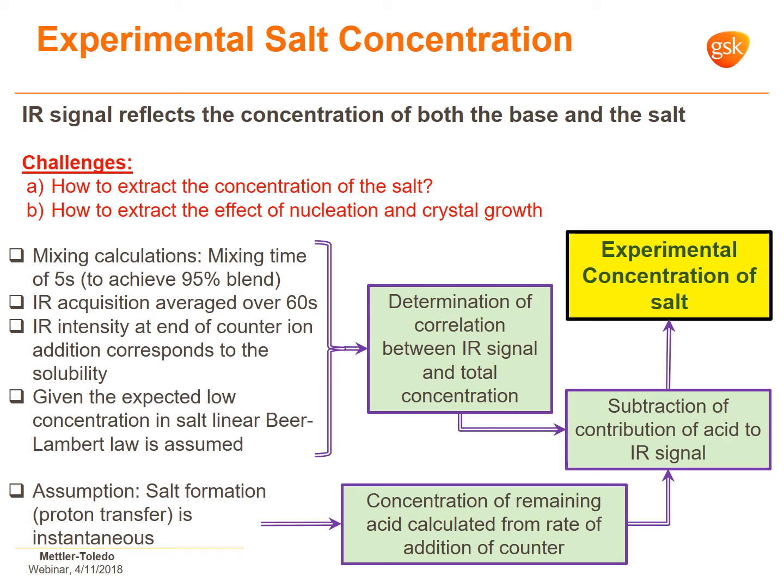The assumption that we make is that the salt formation is instantaneous, meaning that from the moment the counter-ion hits the solution, it reacts with the available parent in there. So from these 3 or 4 bullet points, we determine the correlation between the IR signal and total concentration. Okay, so that's the total concentration, meaning the contribution of the parent and the contribution of the salt.